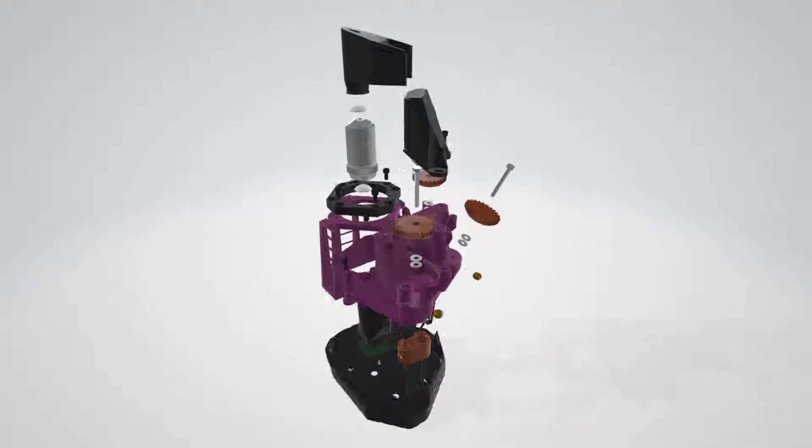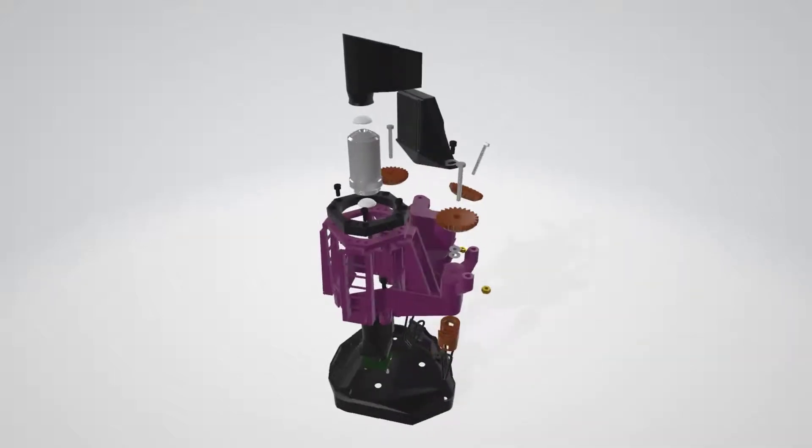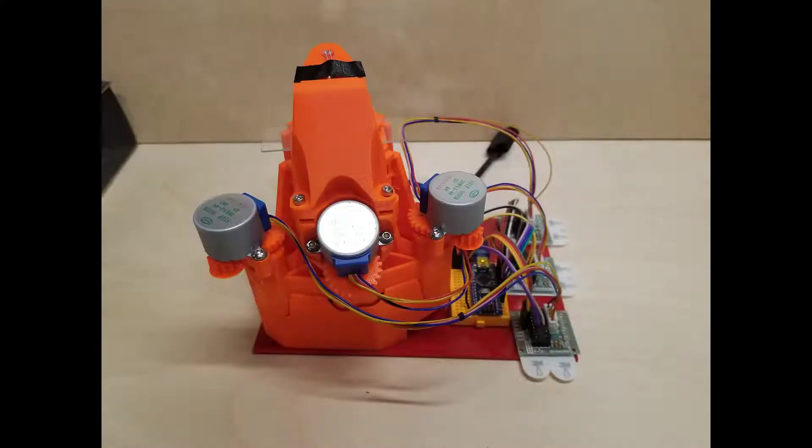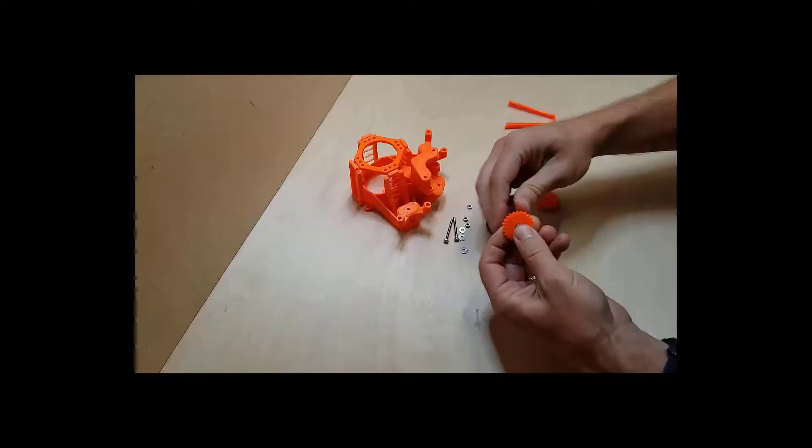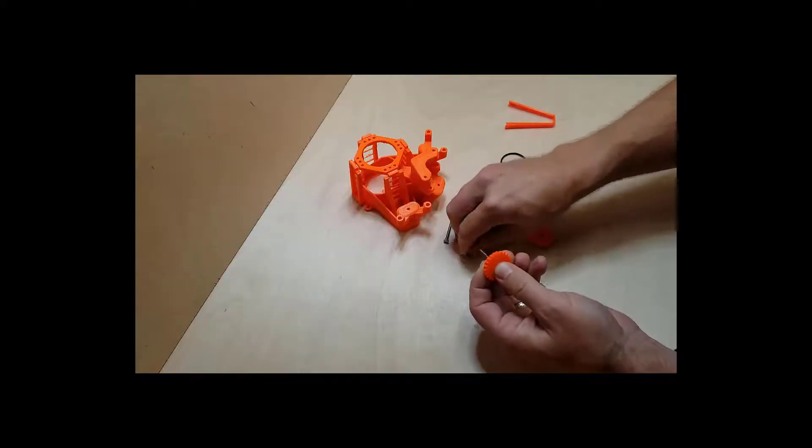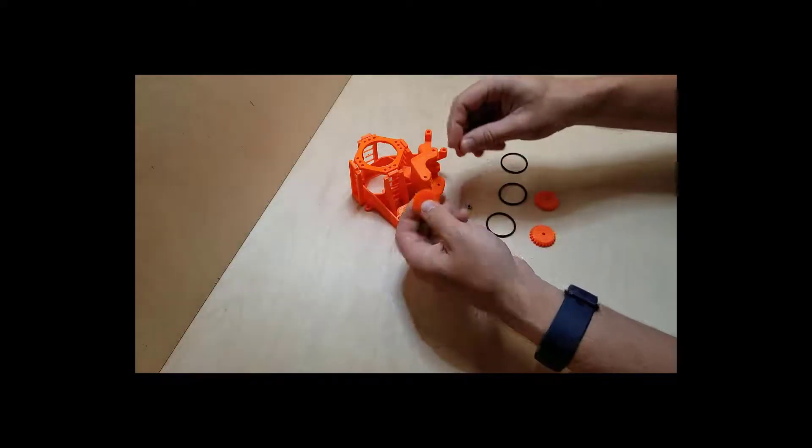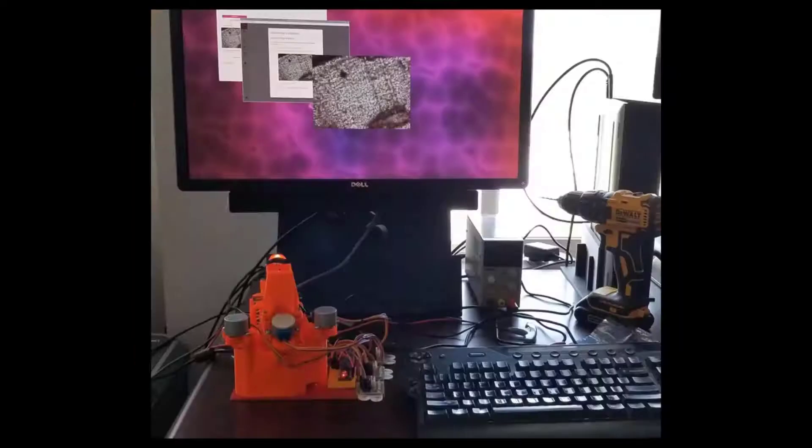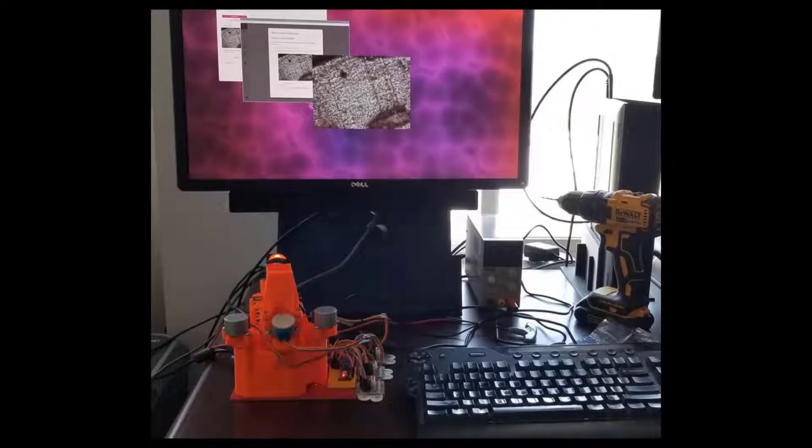Today we're taking a look at the world around us, up very close, with an open source microscope that you can build. See my video here for an in-depth walkthrough on how to make one. With this level of magnification, we can see how much more intricate things are like hair, spider silk, and even household dust. Here are five things to look at with a microscope that you can build.